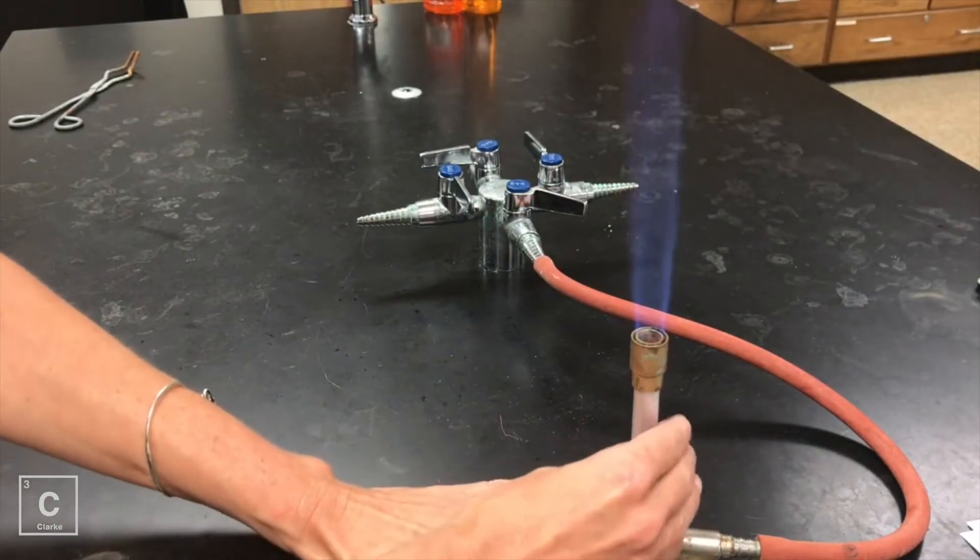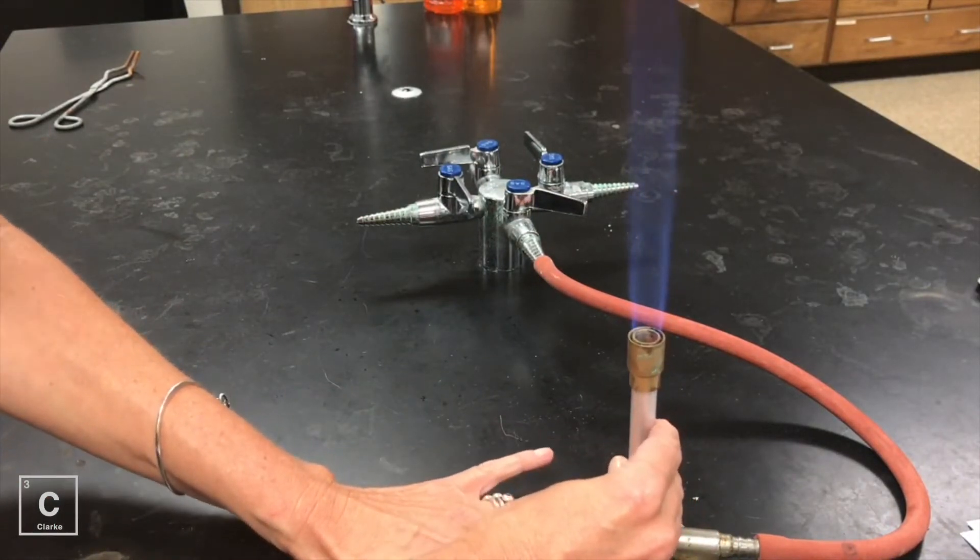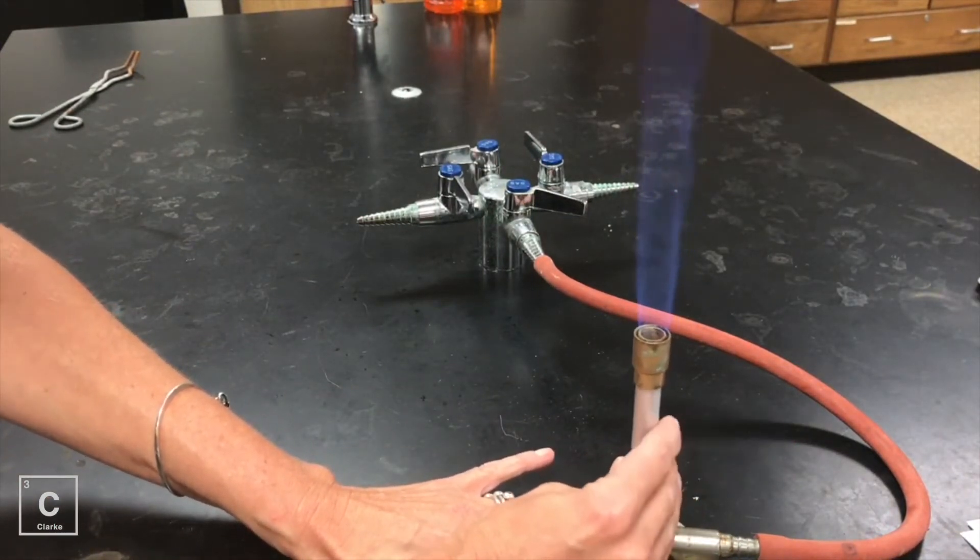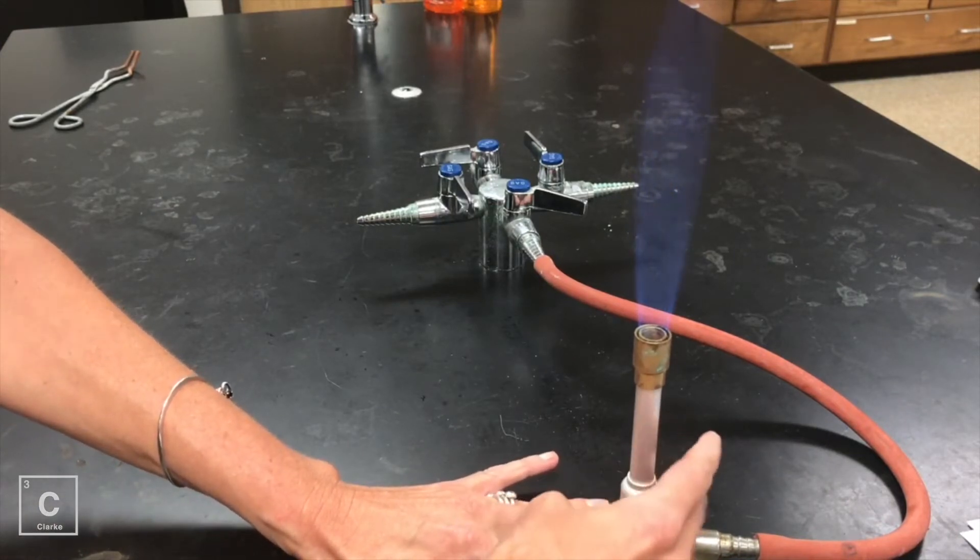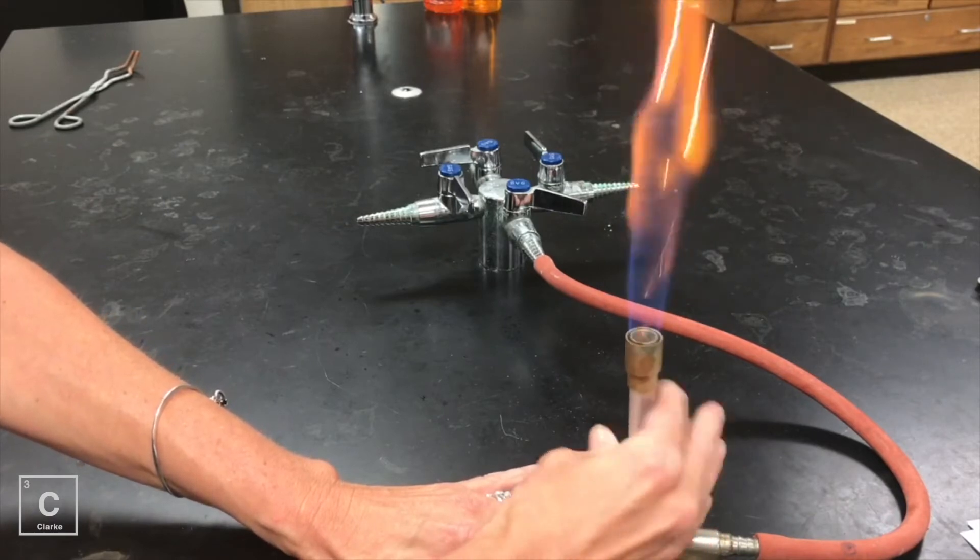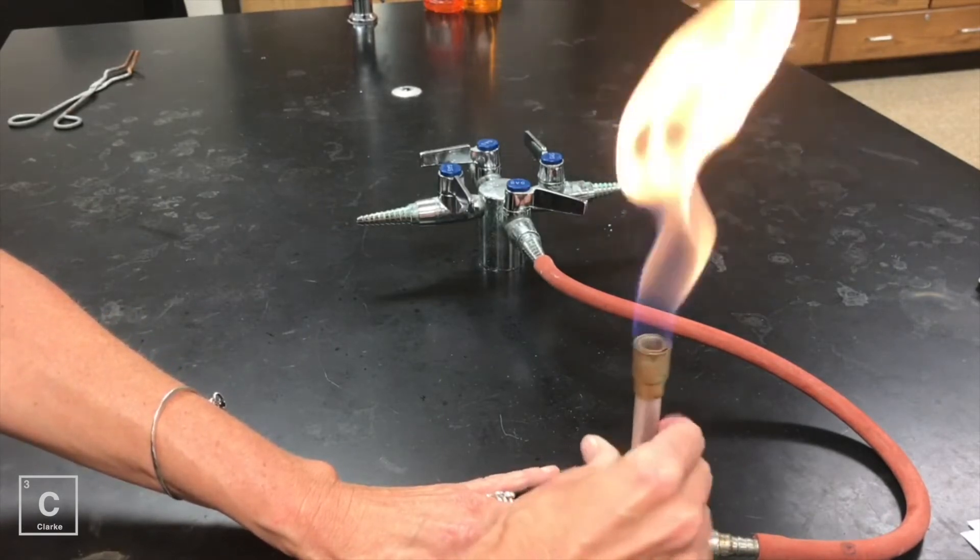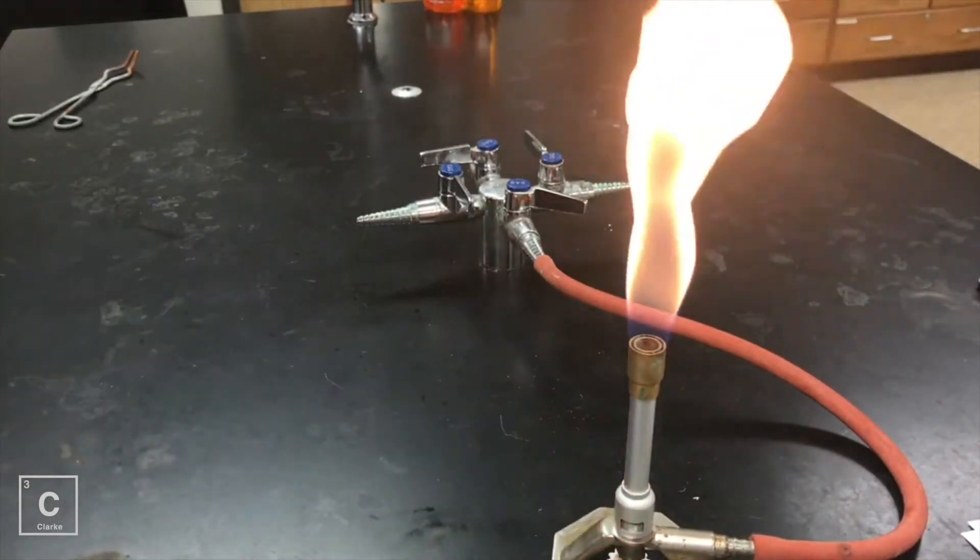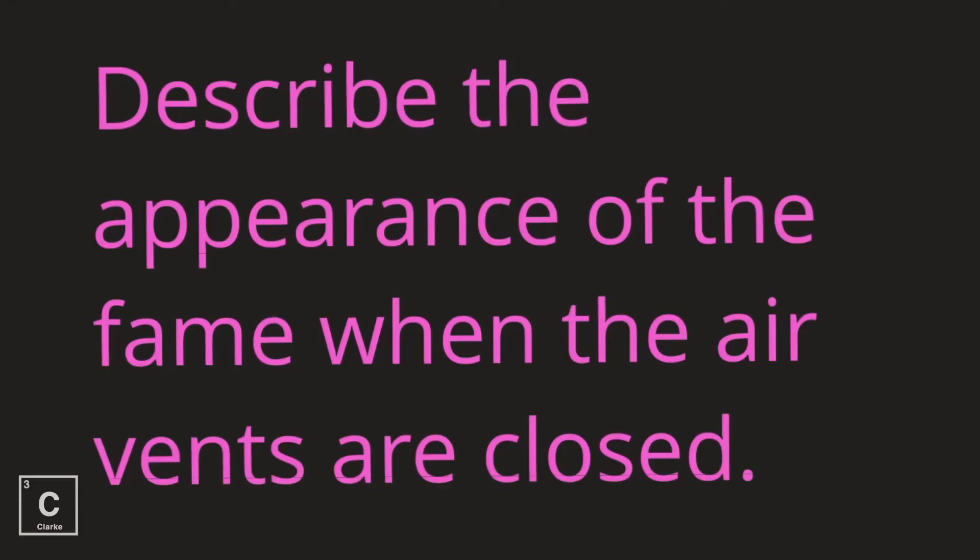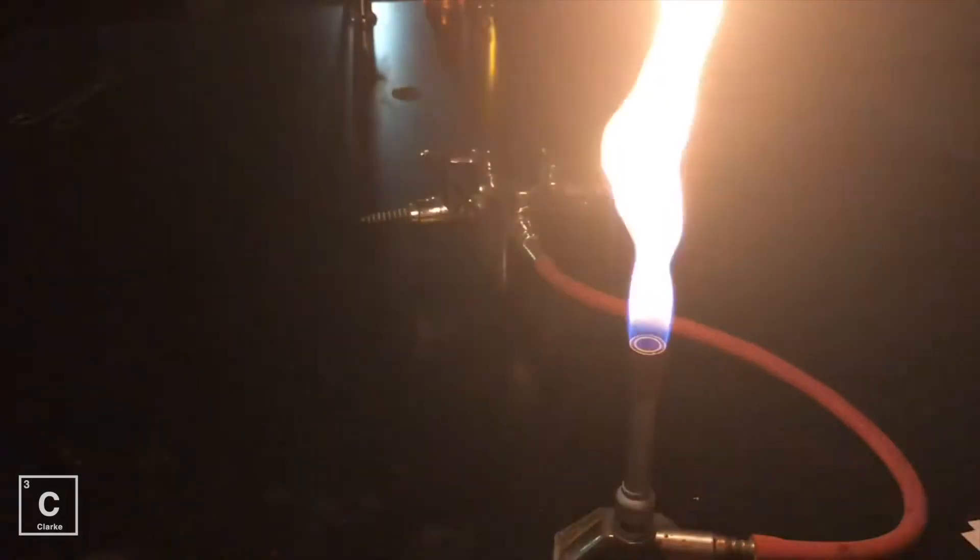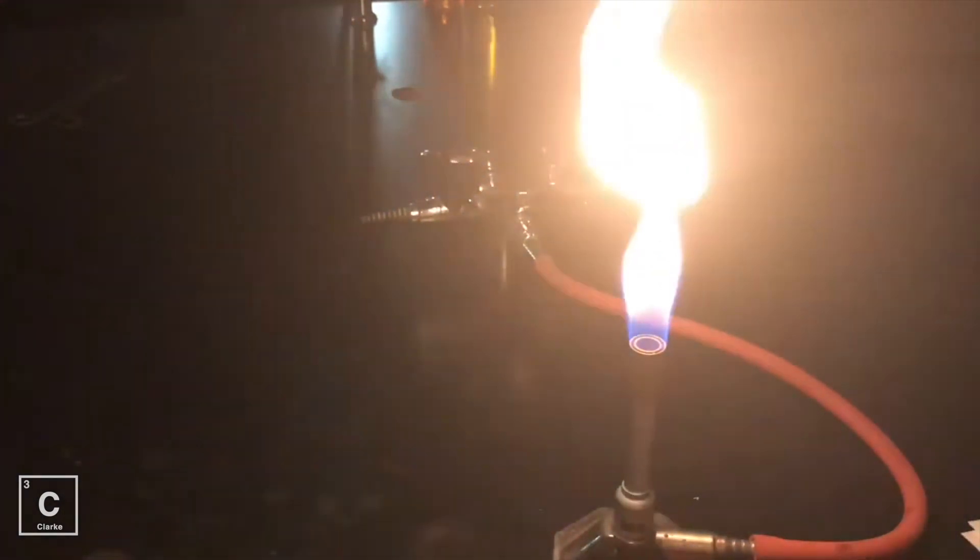So next we're going to close the vent completely. Don't worry this barrel should not be hot. If it's very hot then something's wrong with your Bunsen burner. Make sure and let your teacher know. Also, I want you to describe the appearance of the flame when the air vents are closed. This is called a safety flame. And this is the coolest flame that a Bunsen burner can produce.